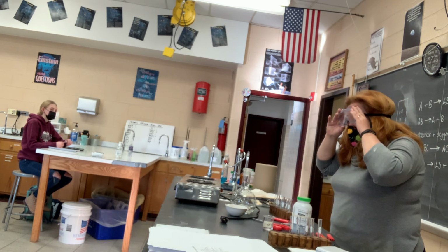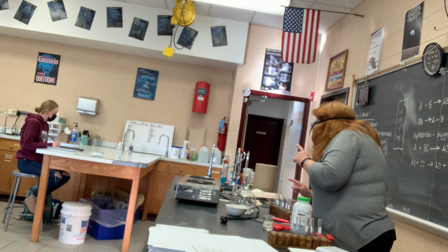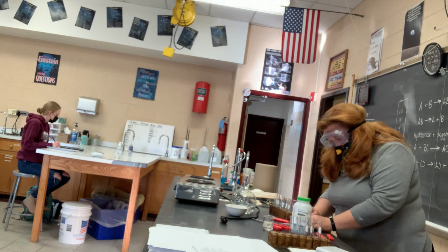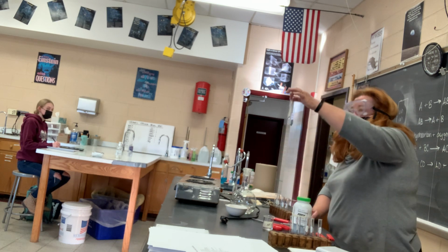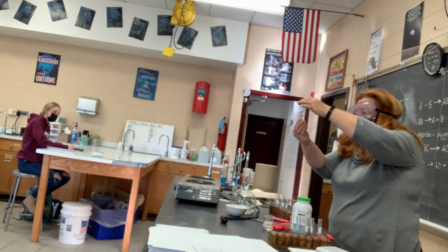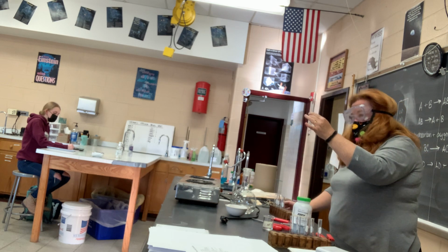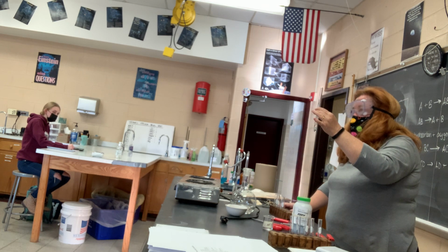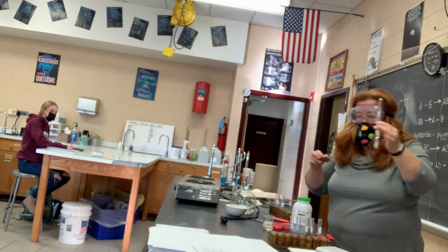The first reaction, part C, is a single replacement. The zinc is going into the hydrochloric acid, and there's bubbles, and it's getting hot. And I'm going to invert the test tube. Can any of you light a match? Do you know how to light a match? Anybody?